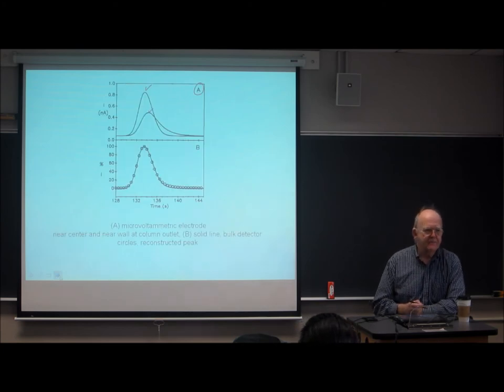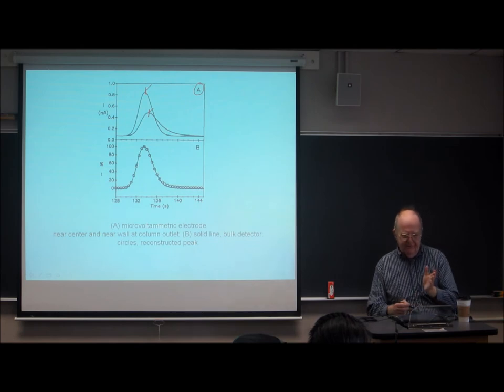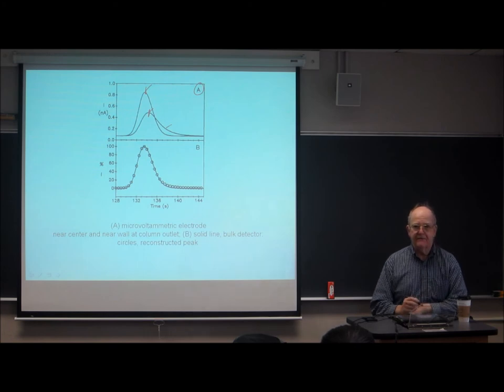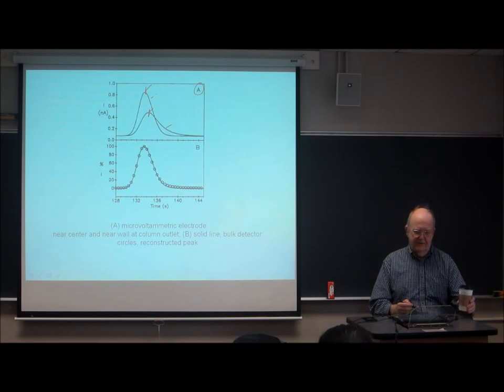Chromatograms are not the same. The peak of this is substantially earlier than the peak near the wall. Not only that, this one's a little wider and is definitely tailed. This one's a little more symmetrical and it's a bit narrower.